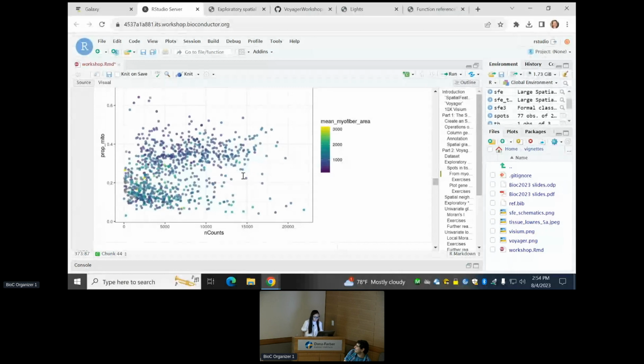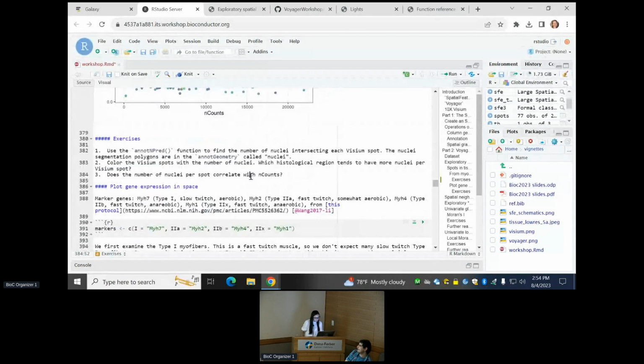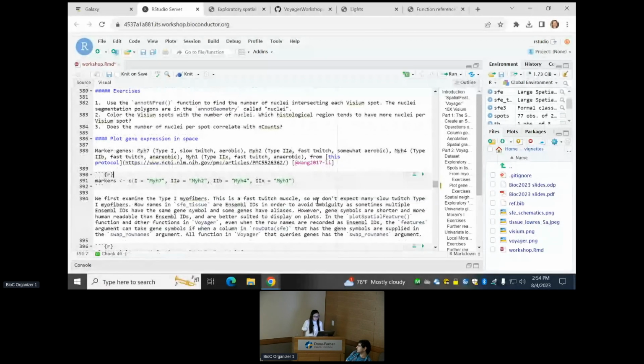No? Okay. I probably won't have the time to go over the exercises, but if you're interested, you can do them yourself after the conference. Next we can plot. Do you want me to make the font larger again?